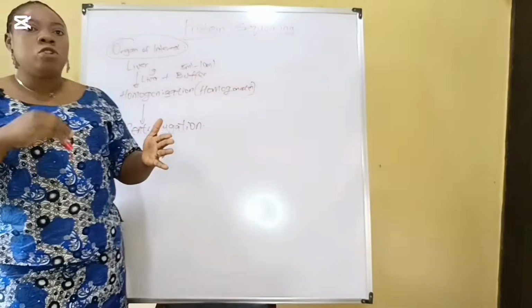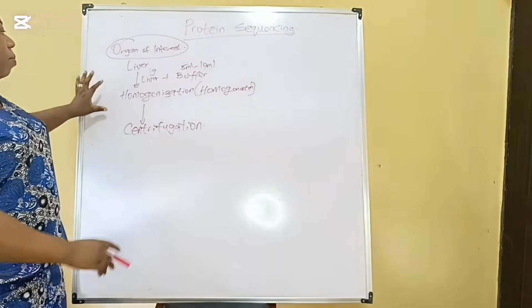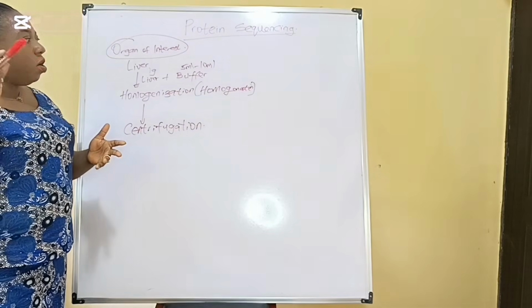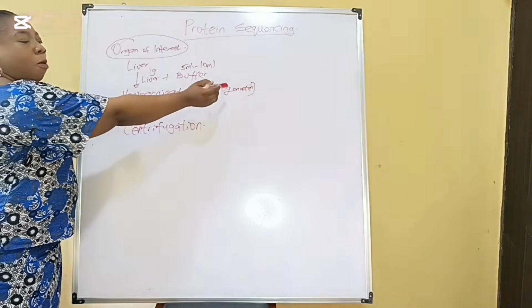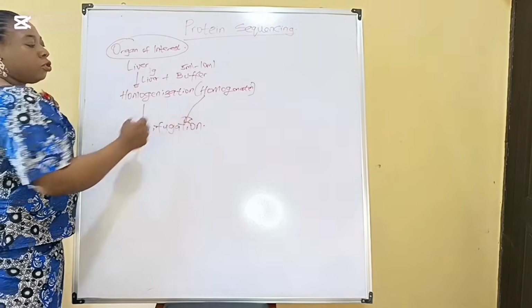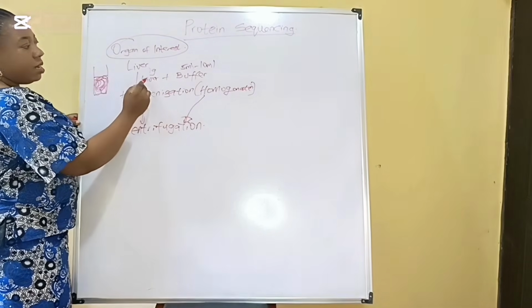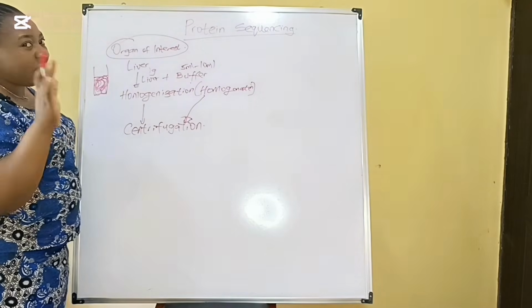And in this process, we just want to separate our paste, which is our homogenate, that we're able to get from the homogenization method, where we make use of either a homogenizer, a sonicator, a blender, or a mortar and pestle, etc. So our homogenate will now come here, and is what we are using for our centrifugation. Let's say this is your paste. After you've blended everything, the liver and the buffer, you got your homogenate, which is the paste that I'm referring to.